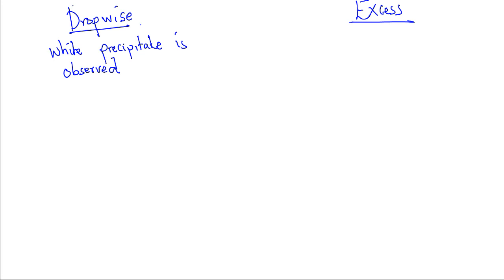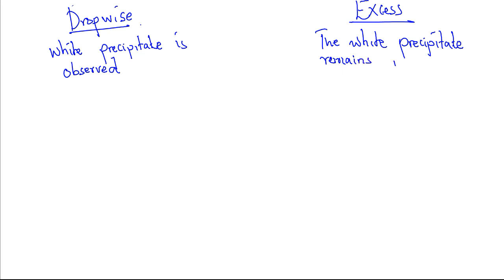In excess, the white precipitate remains insoluble. Let us now see the cases of our white precipitate under limited supply and excess.